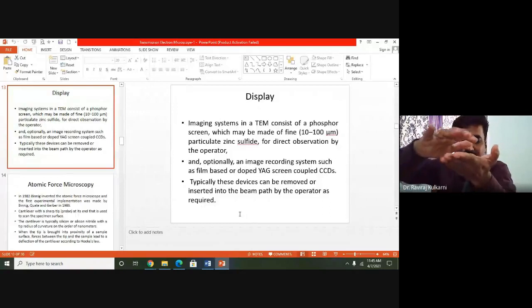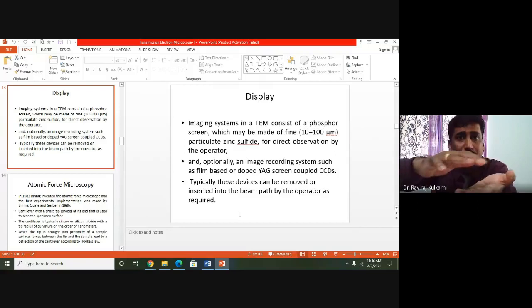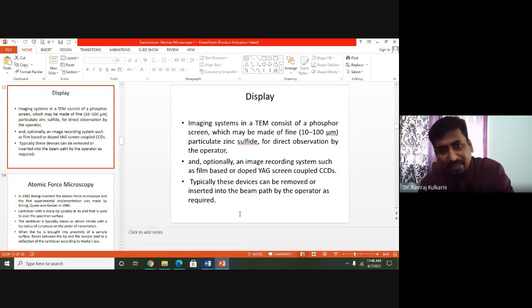How does a blind person see? Slowly I can move this cantilever or my other hand, so I can create an image in my brain. This is called an atomic force microscope, also known as a probe microscope. Either you can see the nanoparticles or you can feel them. You can image the nanoparticles either by electrons or by using probes.